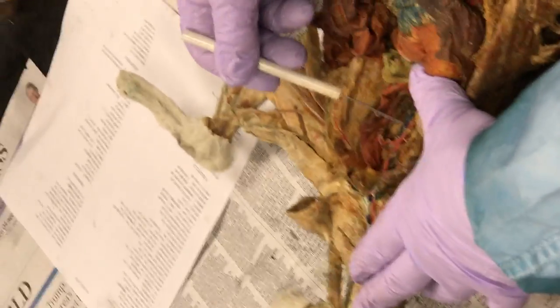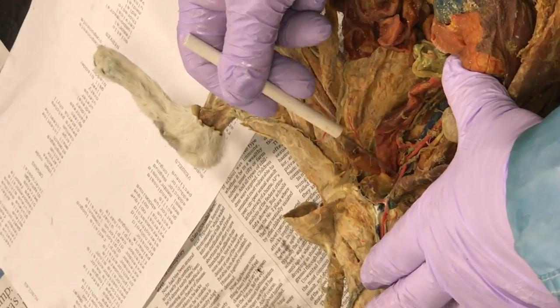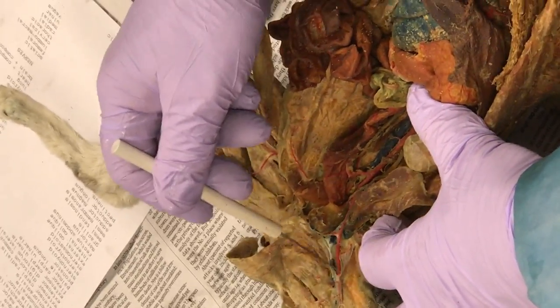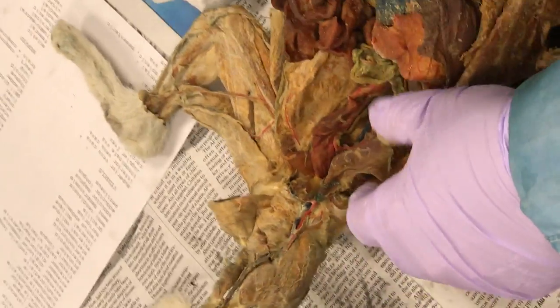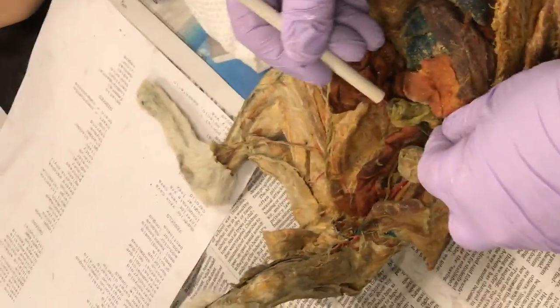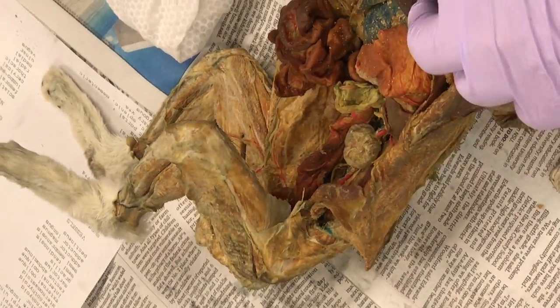Look at that dorsal aorta — magnificent. Look at that: you go to the common iliac, to the external iliac, to the femoral, before it fades out. Wow. Look at that — renal. Renal goes right into the kidney. Renal artery.